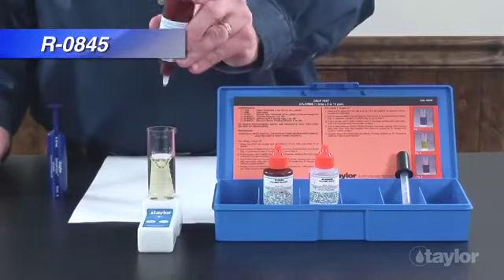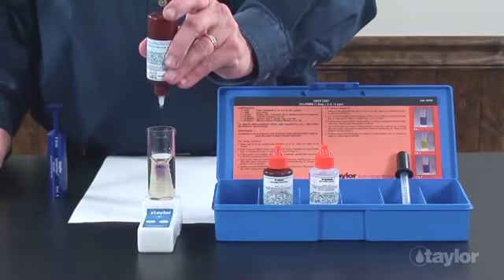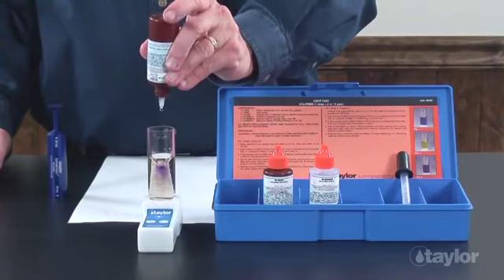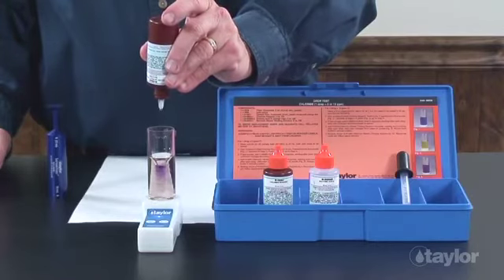Next, add reagent 845, mercuric nitrate titrating solution, dropwise, swirling and counting after each drop until the color changes from yellow to purple.